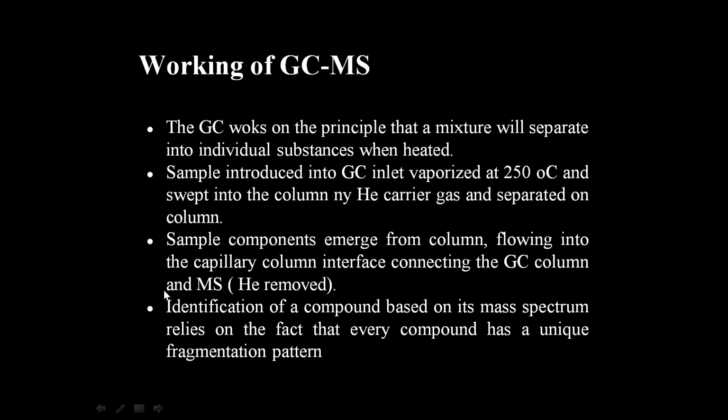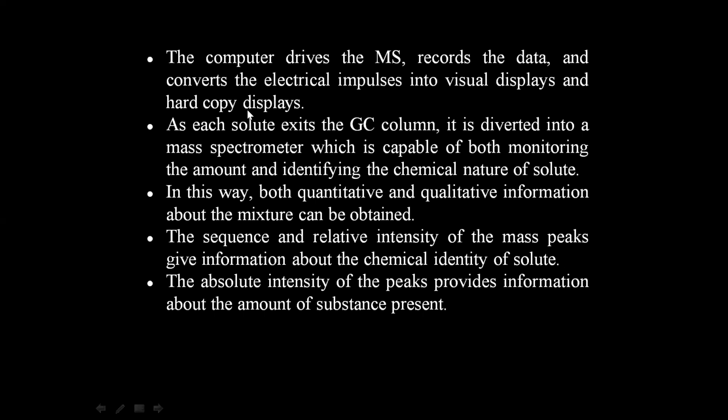MS. Helium is removed. Identification of a compound based on its mass spectrum relies on the fact that every compound has a unique fragmentation pattern. The computer drives the mass spectrometer, records the data, and converts the electrical impulses into visual displays and hard copy displays. As each solute exits the gas chromatography column, it is diverted into a mass spectrometer, which is capable of both monitoring the amount and identifying the chemical nature of the solute.